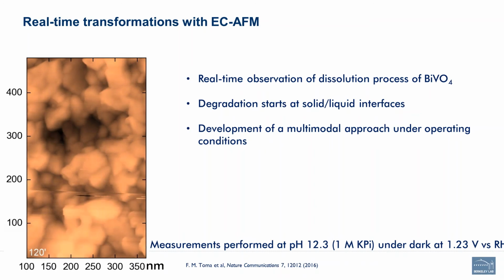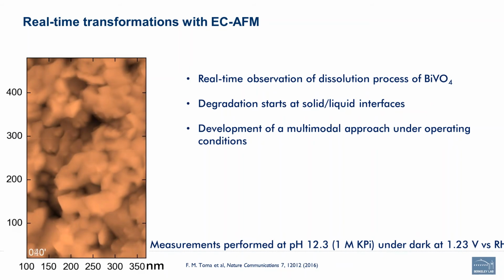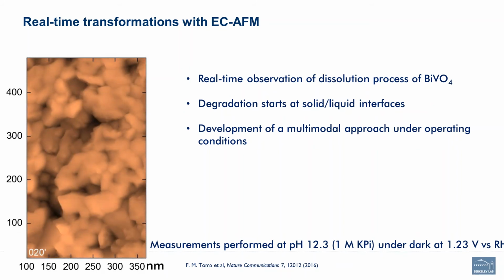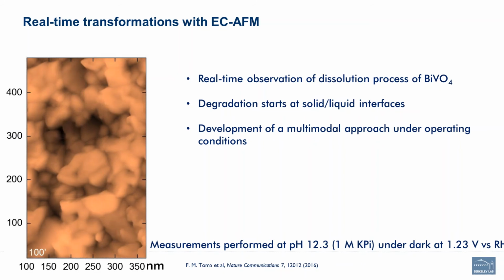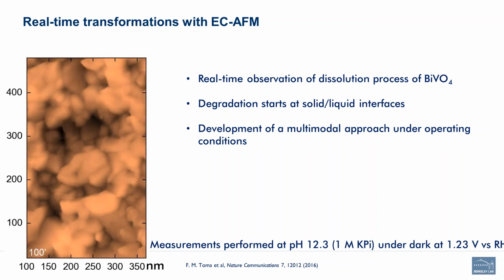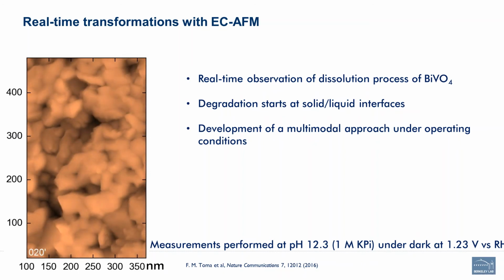Okay. That's too bad. It'd be interesting to see if there's a way to do that. Another question we had along different lines. Since you are interested in the IV curves and the behavior on different parts of a grain, have you, by any chance, tried the data cube mode that I mentioned in the introduction, where you'd get a lot of IV curves?